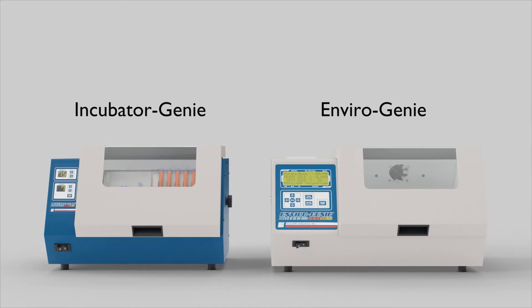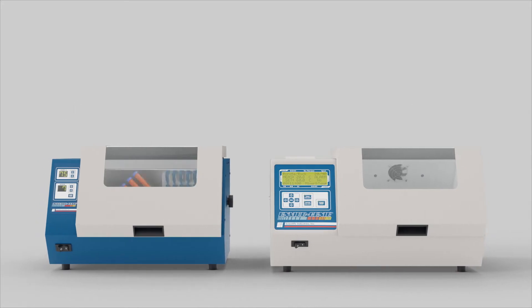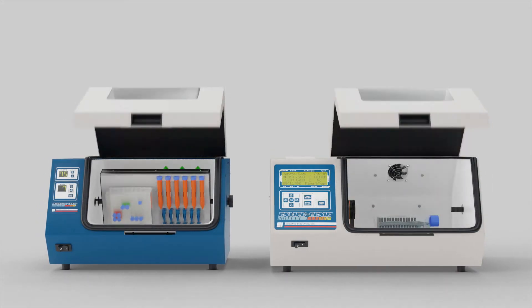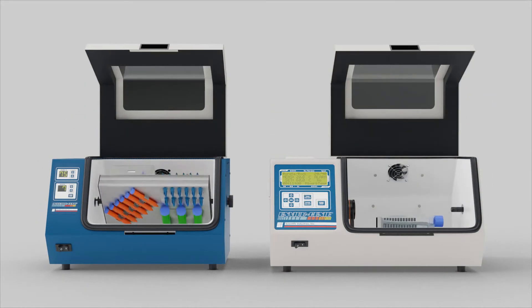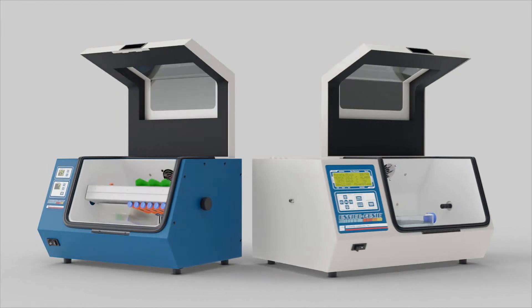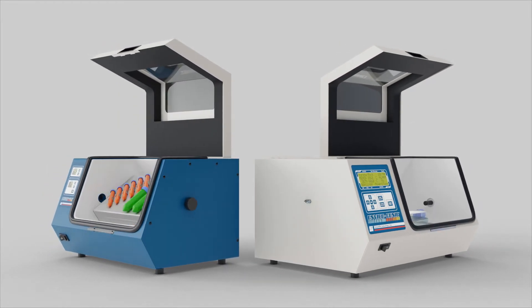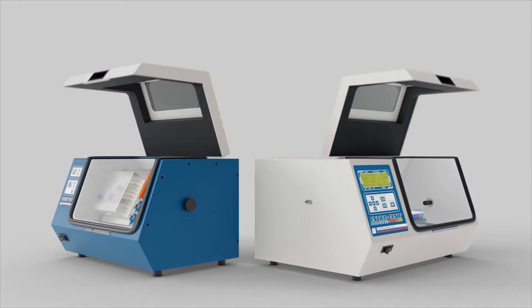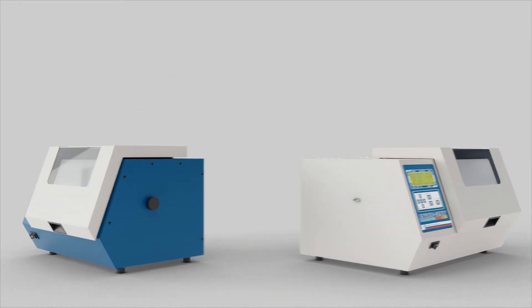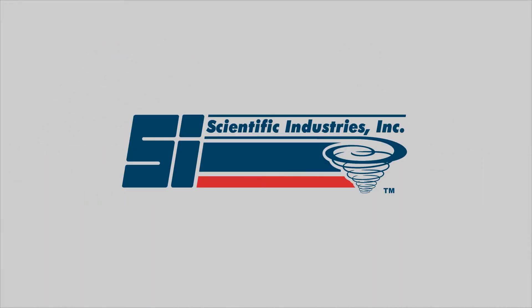The EnviroGenie and IncubatorGenie, designed for the most demanding laboratory applications, built with Genie quality in the USA, backed by a 2-year warranty.